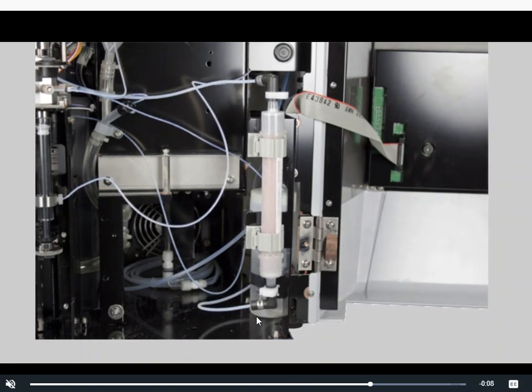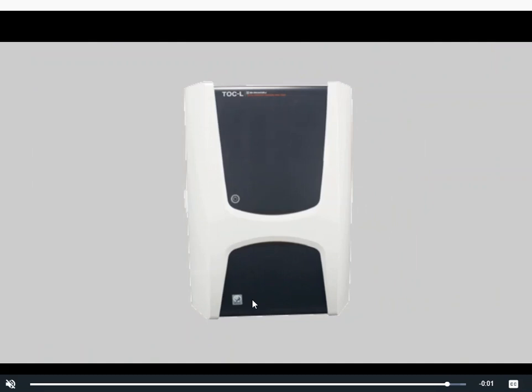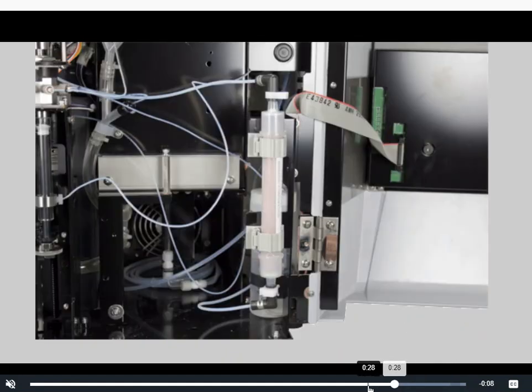and to the top. Those metal clamps, they are going to be quite stubborn when you begin to use them, but the reason is because that helps the tubing to stay in place. You don't want your tubing to come loose, especially through the middle of an analysis. So those little bitty metal clamps that you saw there at the ends and at the tops of that halogen scrubber, let me kind of zoom in on that picture again so you can see them. So right here at the bottom, and then up here at the top, it's on the black kind of piece of rubber that sits up on the top.